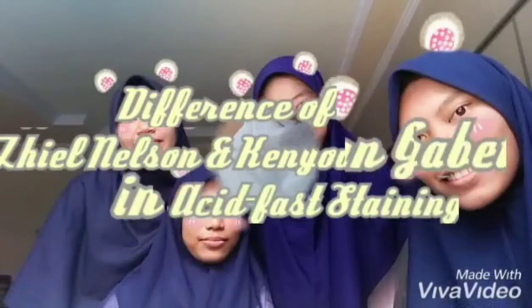We must pay attention to the Ziehl-Neelsen staining: in the heating process, please try not to boil, but heat just enough for white steam to appear. Finally, the staining will succeed if we do the procedure in stages and effectively.